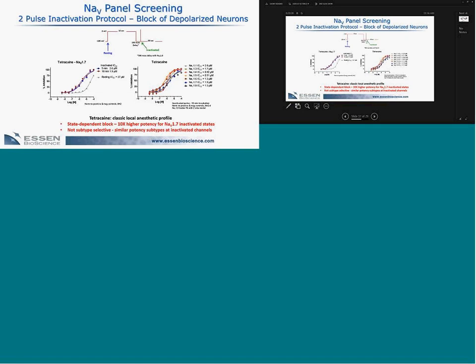The problem is that repeat applications are kind of difficult due to the nature of some of the stimuli and some other things that aren't completely understood. So it's very hard to do this in the kind of standard agonist protocol where you would apply an agonist and then apply an antagonist and look for a difference. So it's kind of made that kind of experimental approach pretty difficult, and we've gone ahead and developed an IonWorks Barracuda assay for this that kind of gets around that.